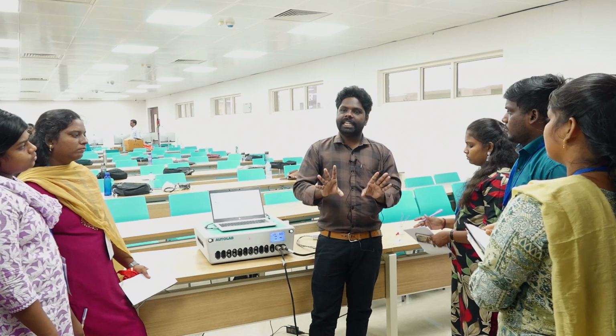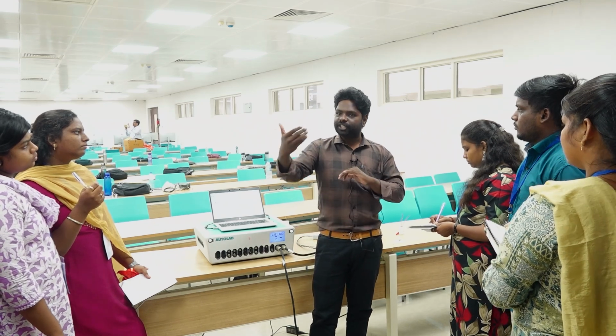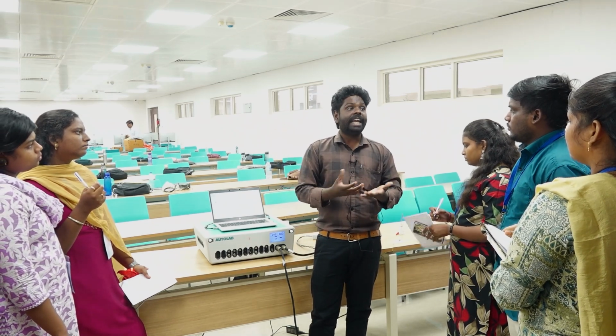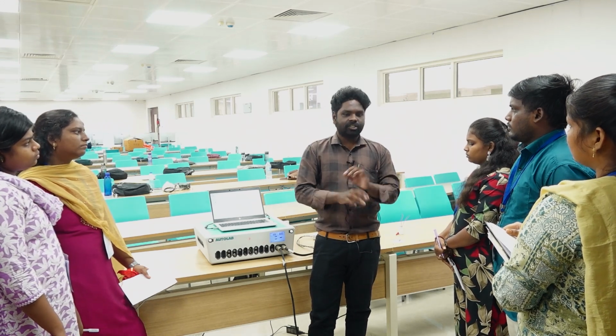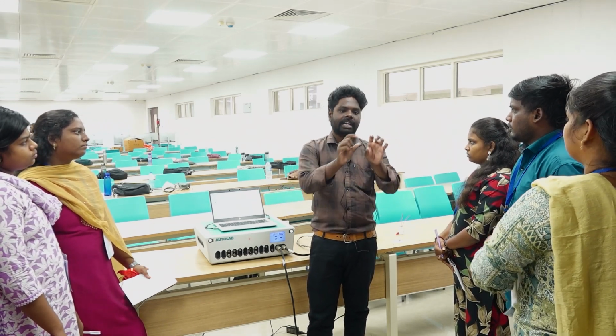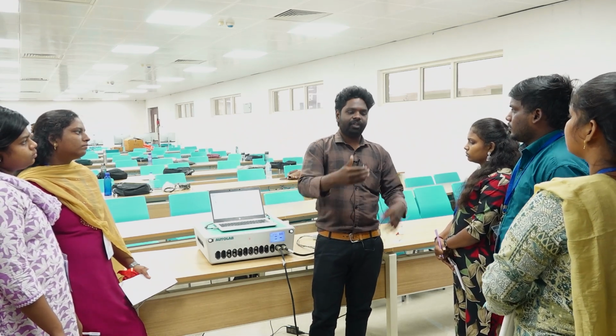If you run an EIS, you will get data, but that is not a direct result. Once you get the data, you have to interpret it, and that interpretation is very, very important here. It's not like other analytical instruments where we get direct results in ppm. Here we only get the data. After that, we have to analyze and interpret the data. So this is the basic information for EIS.